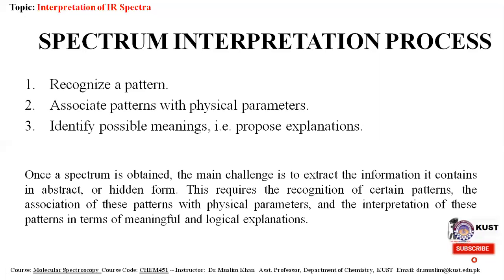So once a spectrum is obtained, I want to summarize. The main challenge is to get this purpose explanation from this spectra, to extract the information it contains in abstract or hidden form. This requires the recognition of certain patterns, and then association of this pattern with physical parameter, and the interpretation of these in terms of meaningful and logical explanation in science.